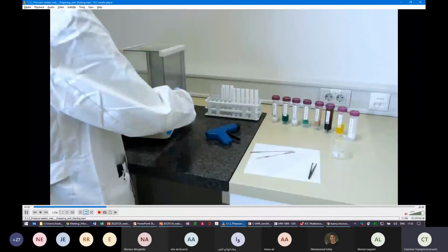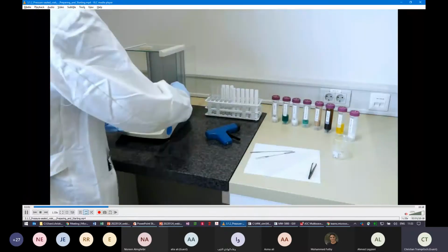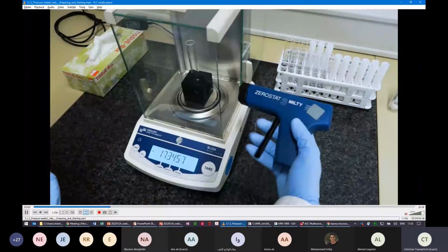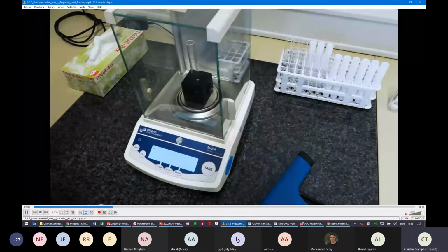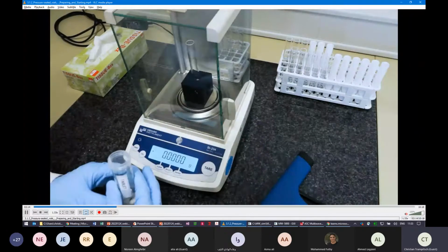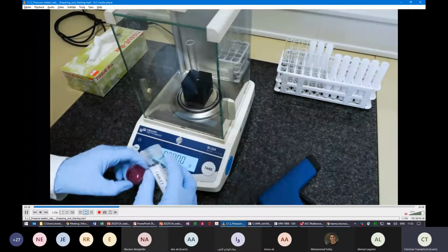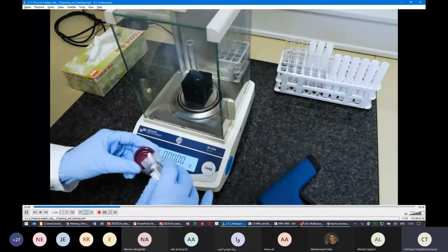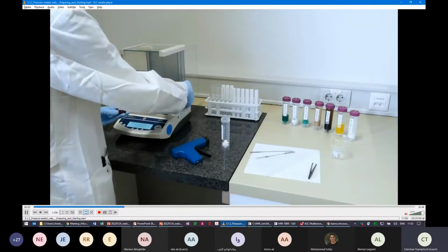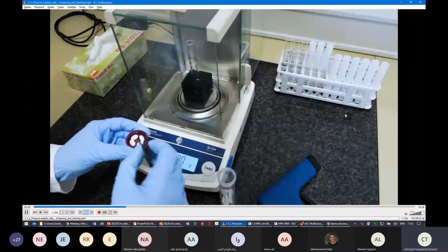And we always will get the same temperature. You should not use different acid mixtures in one run in a rotor-based system, because then most likely one of the acid mixtures will go up to a higher temperature, the other will go to a lower temperature, and you will not get the same temperature for all vessels. Here with that system, that works nicely.